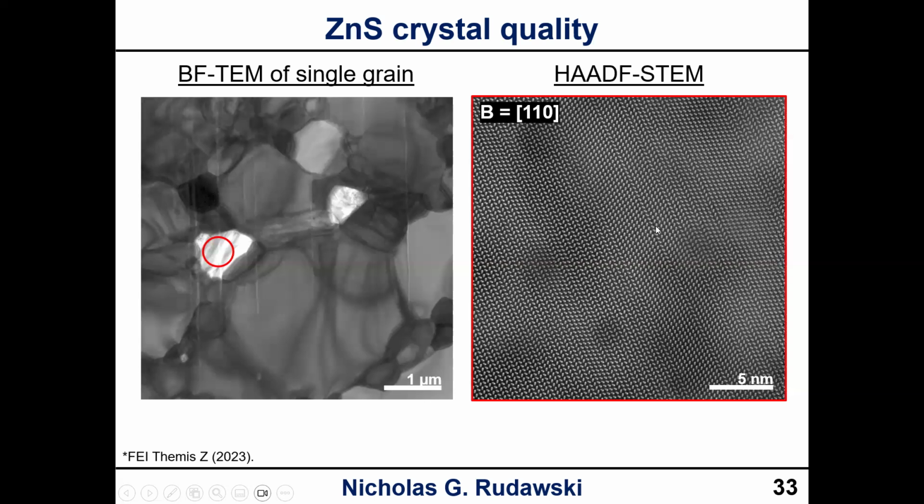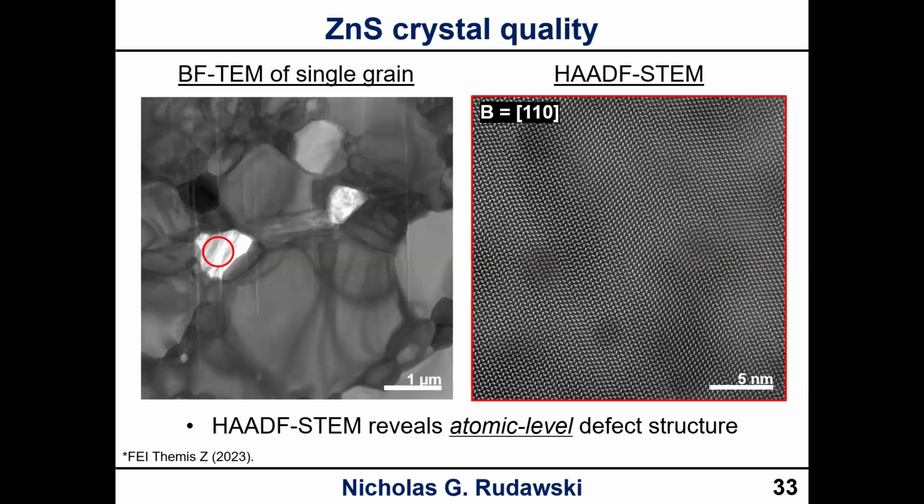And then there's a single stacking fault right here. It goes back to zinc blende. Then we have a small region here where it goes back to wurtzite, and then it goes back to zinc blende, and there's another big region here of the zinc blende, and then this again becomes wurtzite out here, okay? So this is really useful, right? Because we can actually see the true atomic structure of the defects, okay? Which we can't really tell just by looking at the diffraction pattern itself.